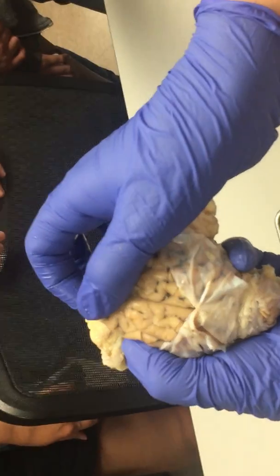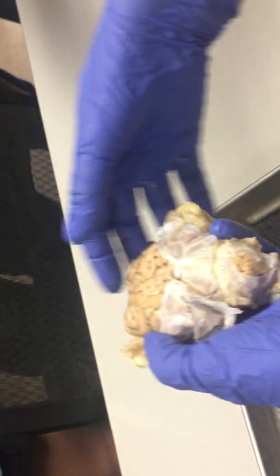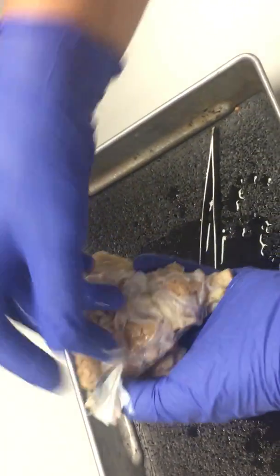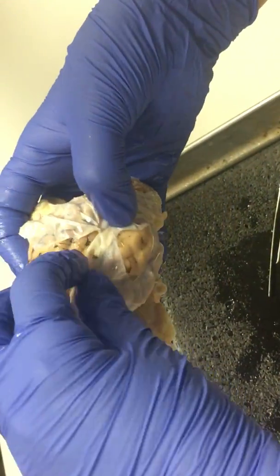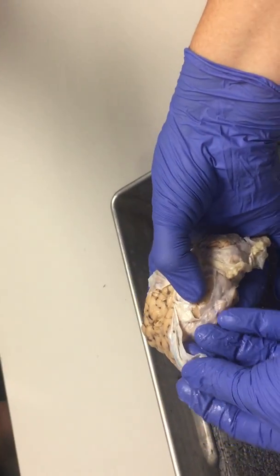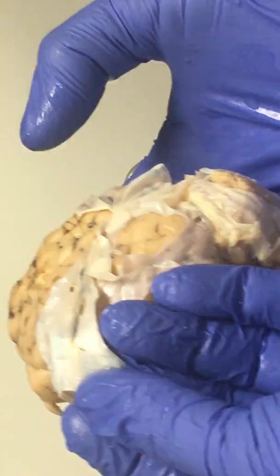The pia mater really is just stuck to the surface — it's really adhering to the brain. This is the longitudinal fissure here. And the dura mater, remember, it makes the falx cerebri. This little thick part there with that black line — the black line is the superior sagittal venous sinus.